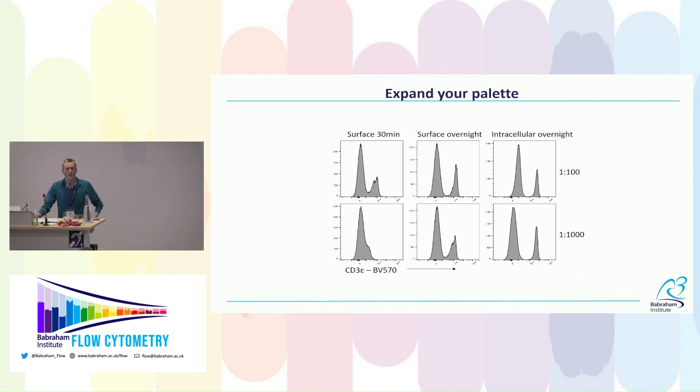Another example with murine cells: CD3 is difficult to stain in mouse cells. With a dim fluorophore like BV570 in a 30-minute staining we don't get adequate separation — there's blurring between positive and negative. Leaving the staining overnight with tenfold less antibody gives really clean separation. That means I can now use this fluorophore and clone, which opens up more options for panel design because antibodies that wouldn't normally work are now working.